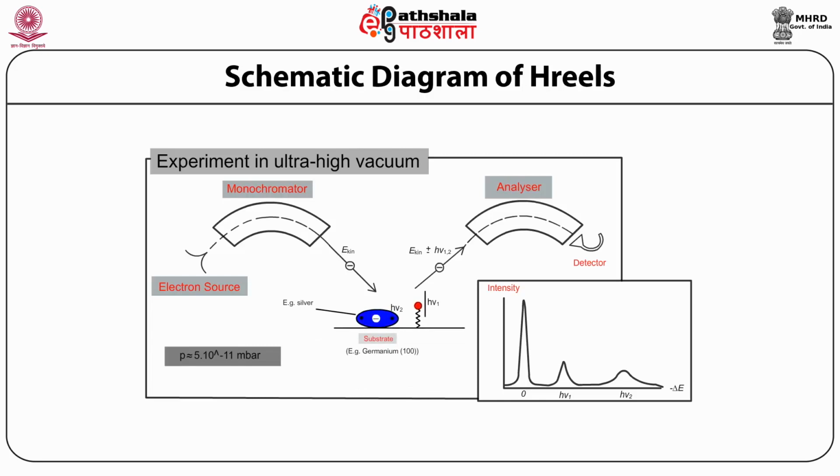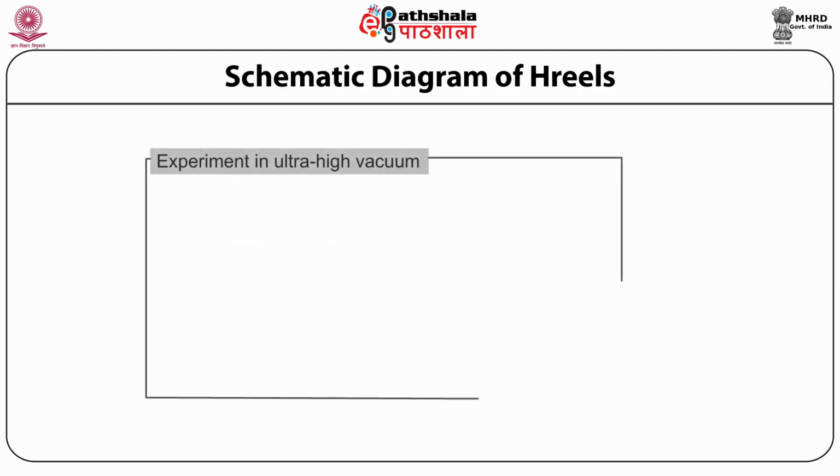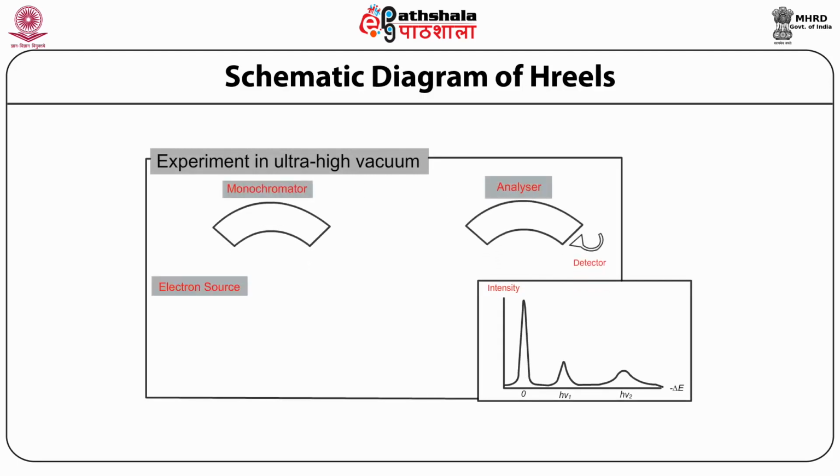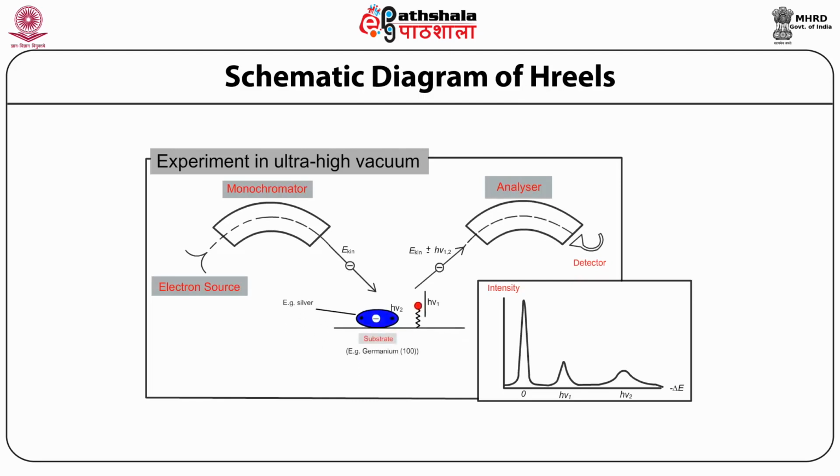Possible interactions are mainly the excitations of vibrations of adsorbate molecules, vibrations of the upper layer of the substrate, that is surface phonons, and vibrations of the electrons in the substrate or in films or islands on the substrate surface, which is what is referred to as plasmons.